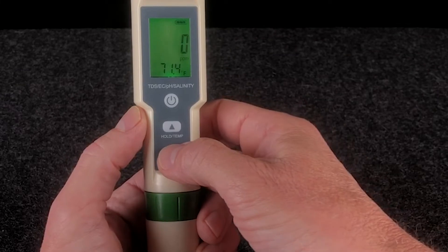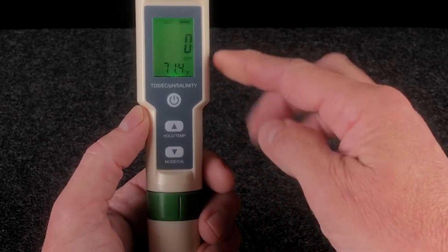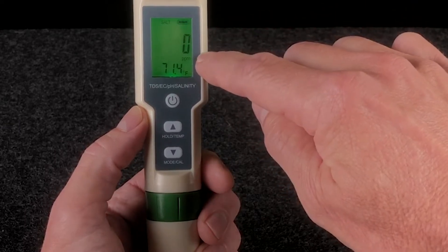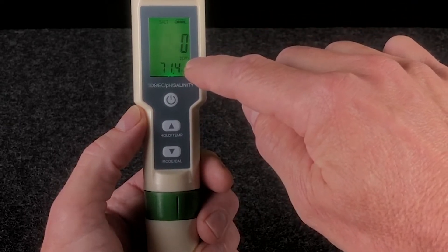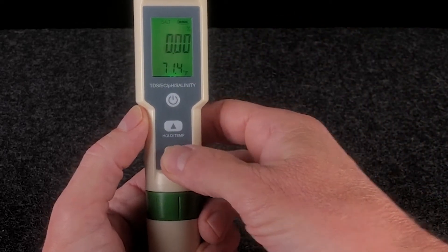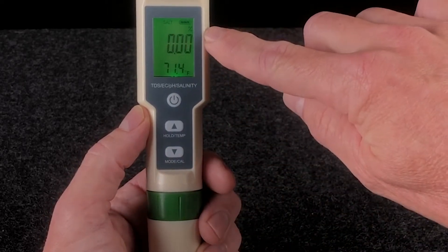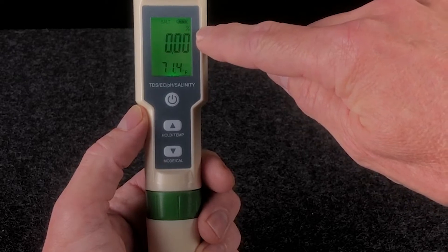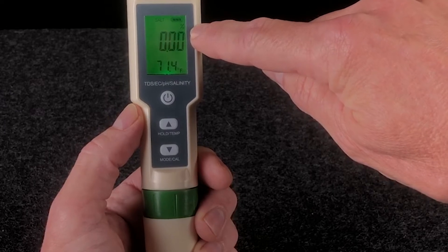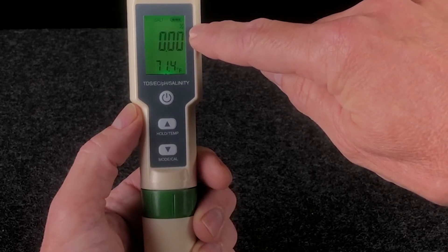So if we hit mode again, now we can see that salt is displayed in the display. This is measuring the salt parts per million content of the tested solution. Hit it again — now we're in salt percentage, and you can see the small percentage sign in the display. That will give you an exact to the thousands measurement of the salt content of the tested solution.